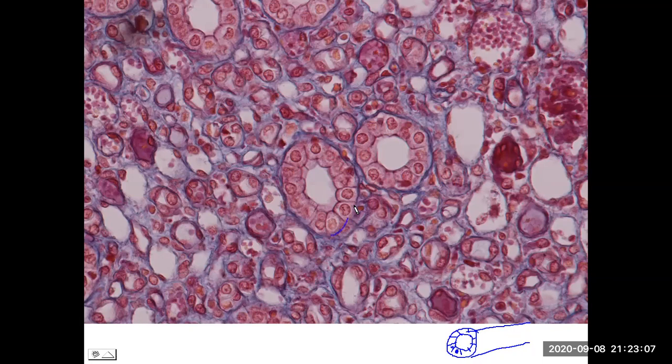And that's what we see here. So I can highlight this section. And again, it's made of these individual little boxy shaped cuboidal cells that just happen to be brought around into a ring structure. So here's a sample for simple cuboidal epithelium. And you notice, of course, it's not everything that we see here on the image, but we have some good examples of simple cuboidal epithelium.